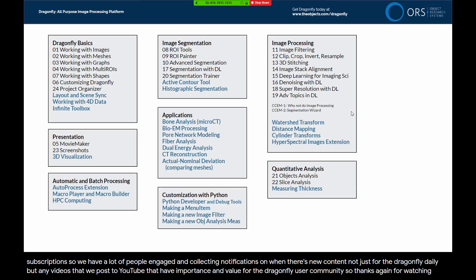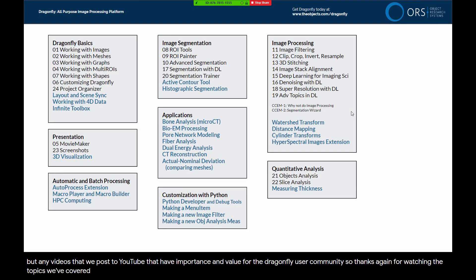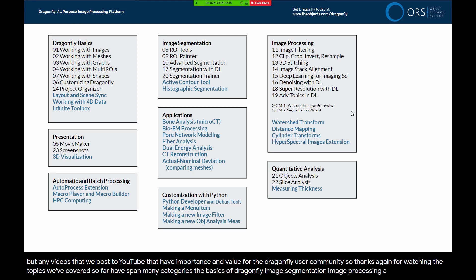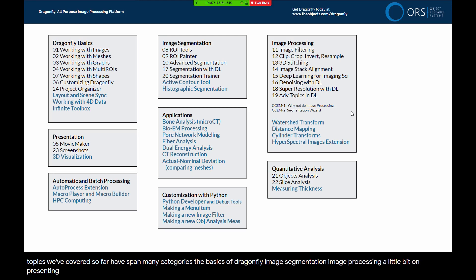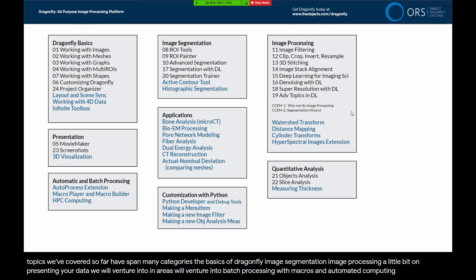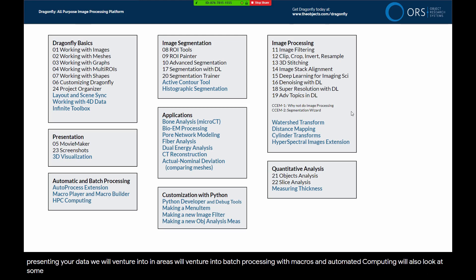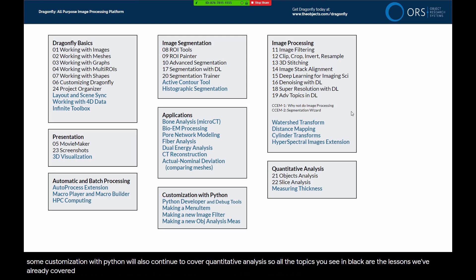Thanks again for watching. The topics we've covered so far have spanned many categories: the basics of Dragonfly, image segmentation, image processing, a little bit on presenting your data. We will venture into application areas, batch processing with macros and automated computing, customization with Python, and continue to cover quantitative analysis. All the topics you see in black are the lessons we've already covered, and in blue are lessons still to come.